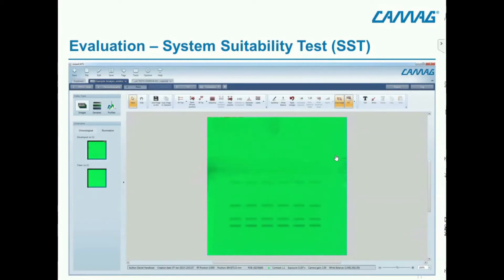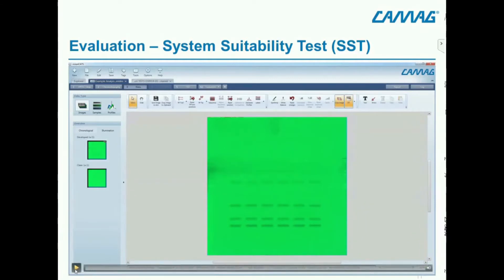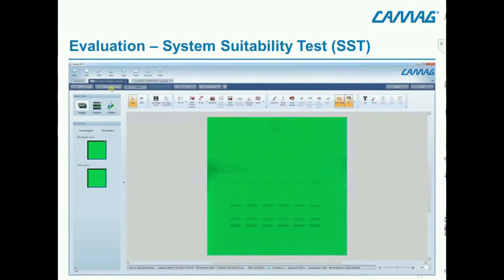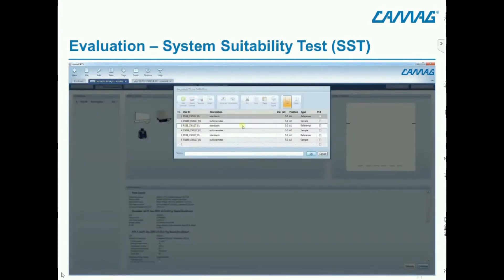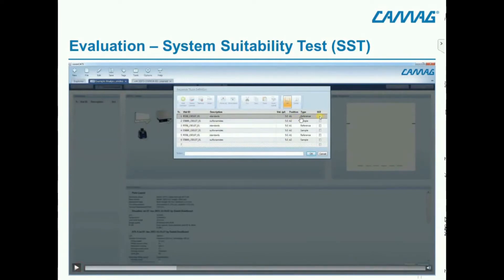In each analysis, we will see how it's done from the analysis file. We go to the tab 'Chromatography', click on the sequence table, and the first track is now selected for SST — for system suitability test.